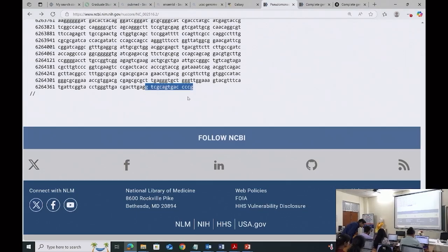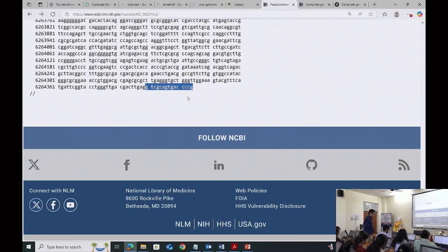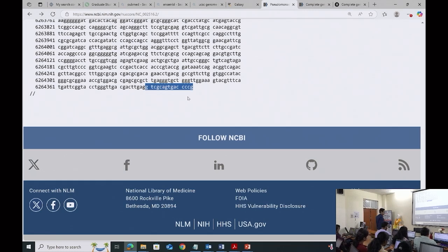Okay, so did you get it? Okay, genome. Yeah, very good. So this is the reference genome. So select this one, the assembly. And then go down, and you will get the accession for RefSeq. Click on this RefSeq. Due to the large size, it is not downloading all features. So you will have to select customize view and allow it to download everything. Customize, all features, sequence also, and then update view. It will download the genome sequence.